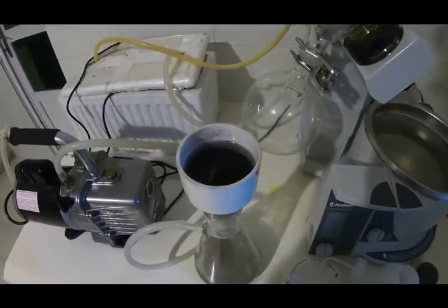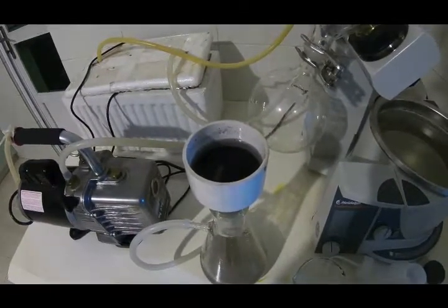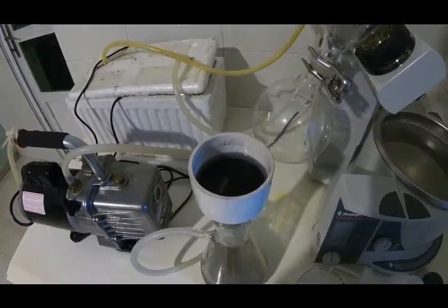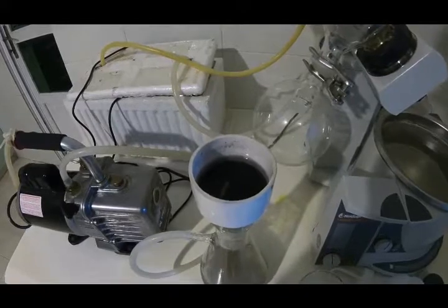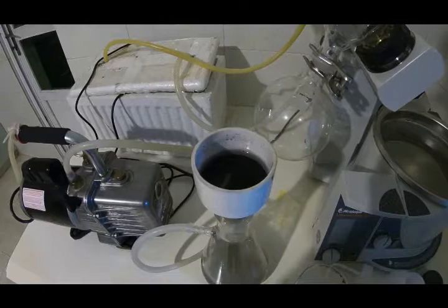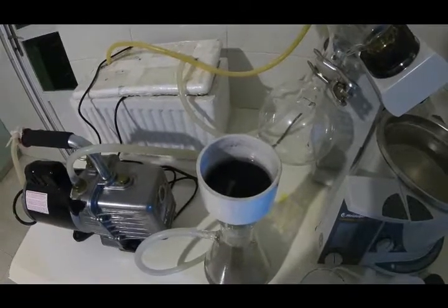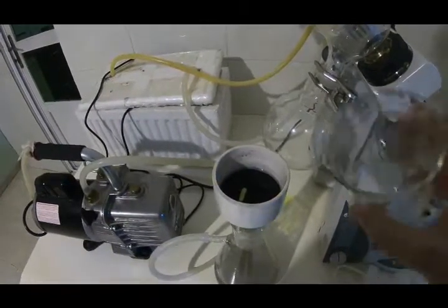After the filtration is done, the palladium on carbon should be dried at room temperature. Don't heat it, because if you heat it, it may ignite. So just dry it at room temperature, or you can dry it in a desiccator or under vacuum, but under no condition dry it by heating it.